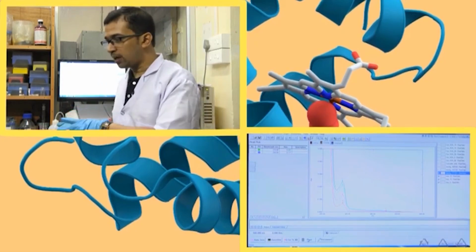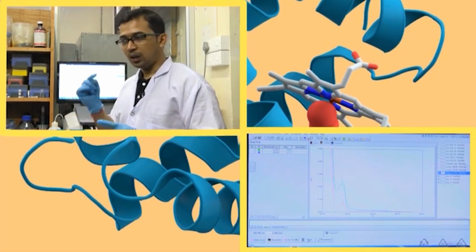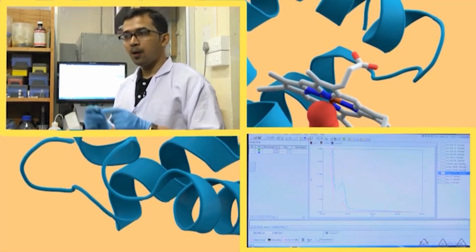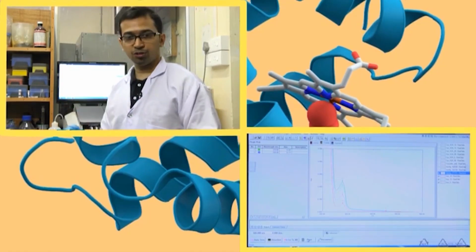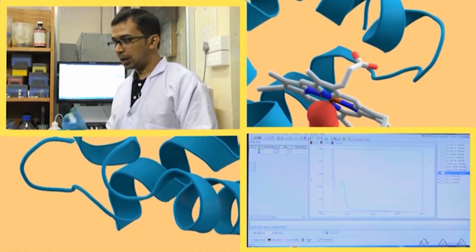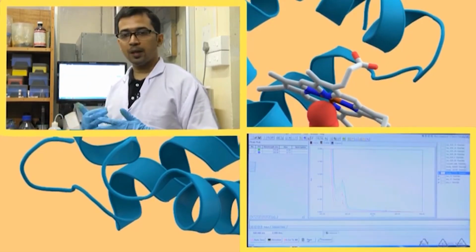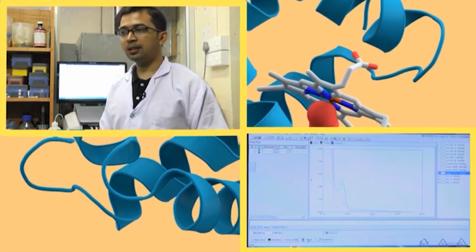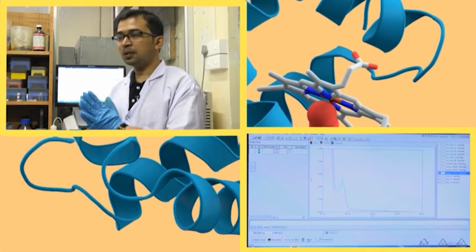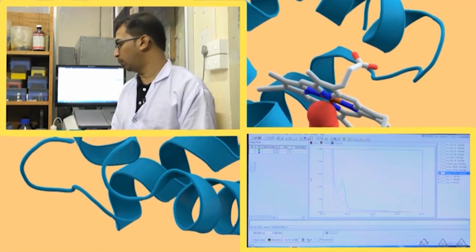So, out here we have taken the ligand, curcumin, and added HSA to it. In fluorescence, we will take HSA and monitor its fluorescence spectra, and to it we will gradually add curcumin. People might ask why you are not doing it with curcumin first. This is actually a standardized method. You can extend this method in whatever way you want, and you have to basically standardize it. Okay. So, this method works for all sorts of protein ligand complexes with a fluorescence spectrophotometer.